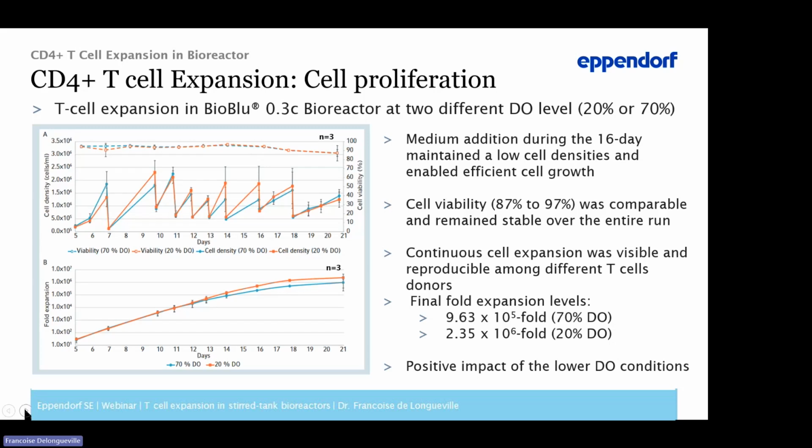Those results indicate a possible impact of the 20% dissolved oxygen on the culture of CD4 T cells compared to the culture performed under 70% of dissolved oxygen.